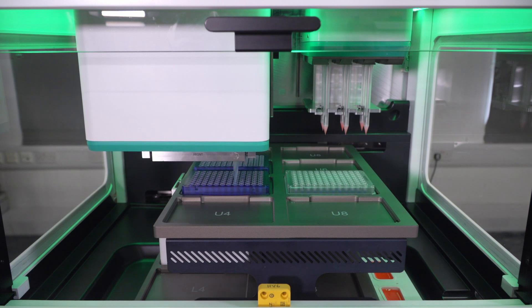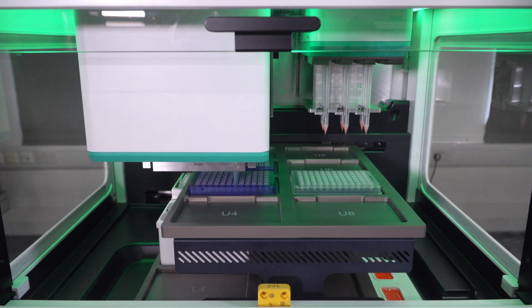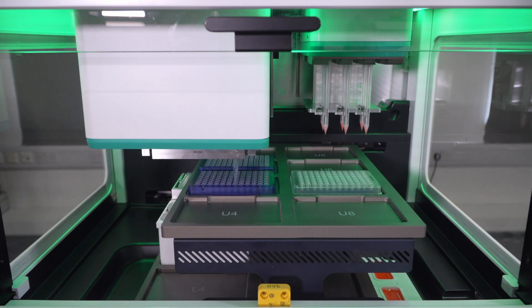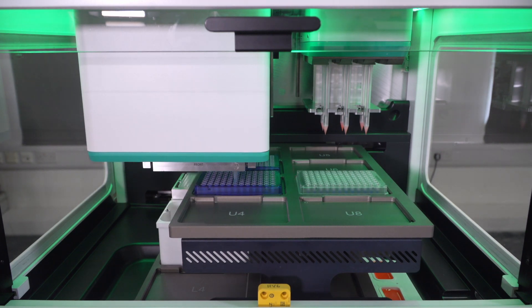You can see the liquid is rising up in the tips as the samples are being pooled from the consecutive columns of the 96-well plate.